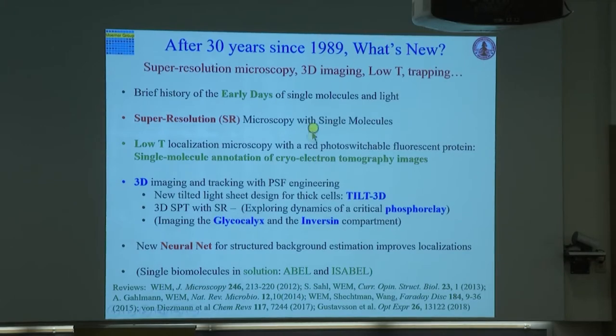So we've been doing some low temperature localization microscopy with single molecules to provide annotation of cryo-electron tomography images. So that's a very new step forward that we think is interesting.